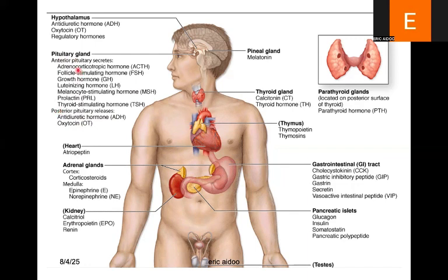And also, more importantly, the components here in the anterior pituitary, we want to look at which of them will stain basophilic and which of them will stain eosinophilic. So that will tell you that you have acidophiles and then basophiles, okay?